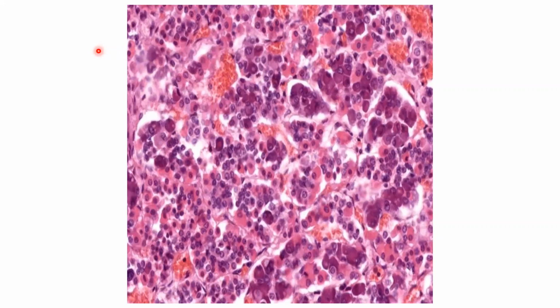Never forget this from the endocrine system, of course you will be getting something. So the light color cells are the acidophilic cells and the dark violet color cells are the basophilic cells. This identification you need.